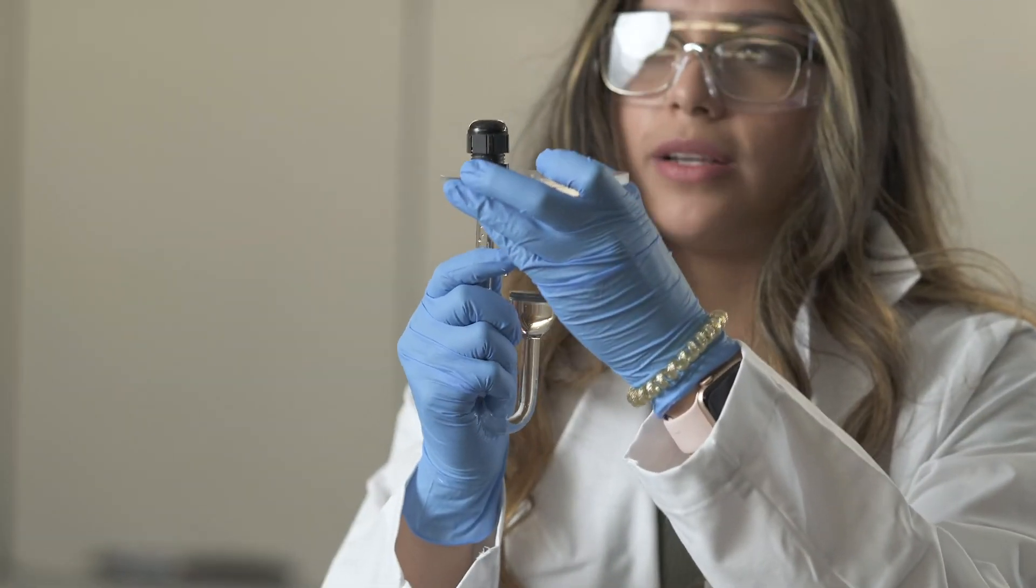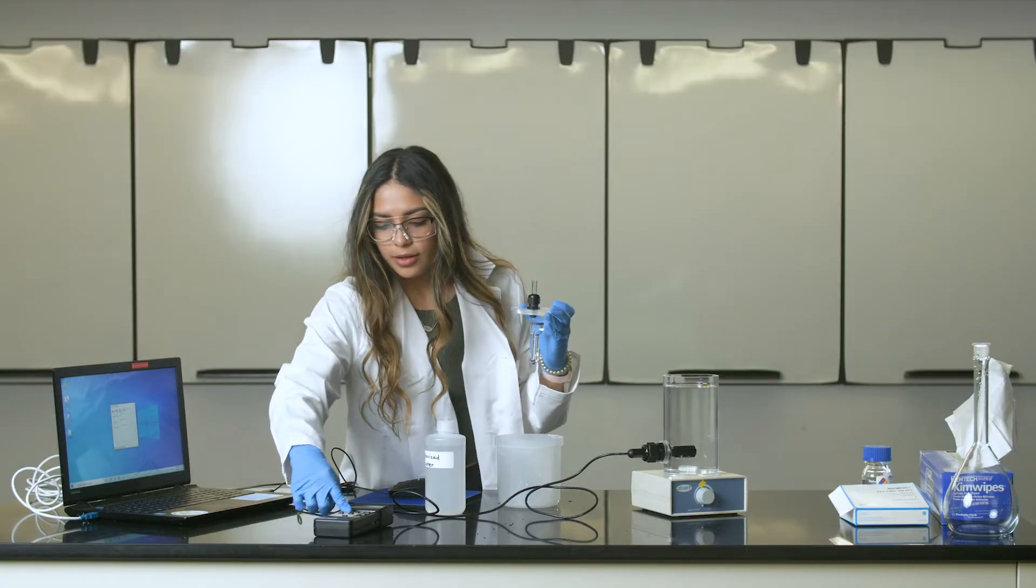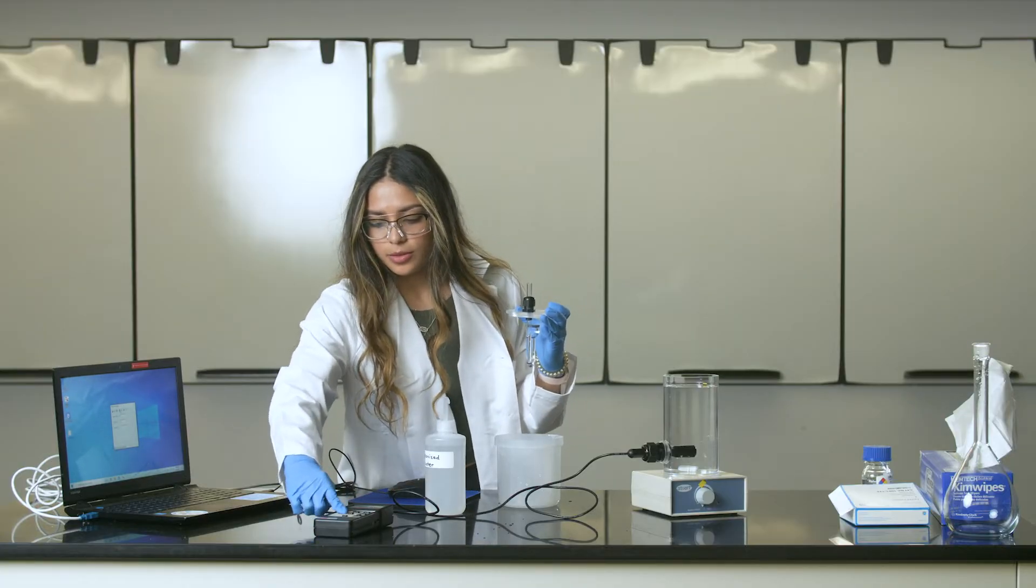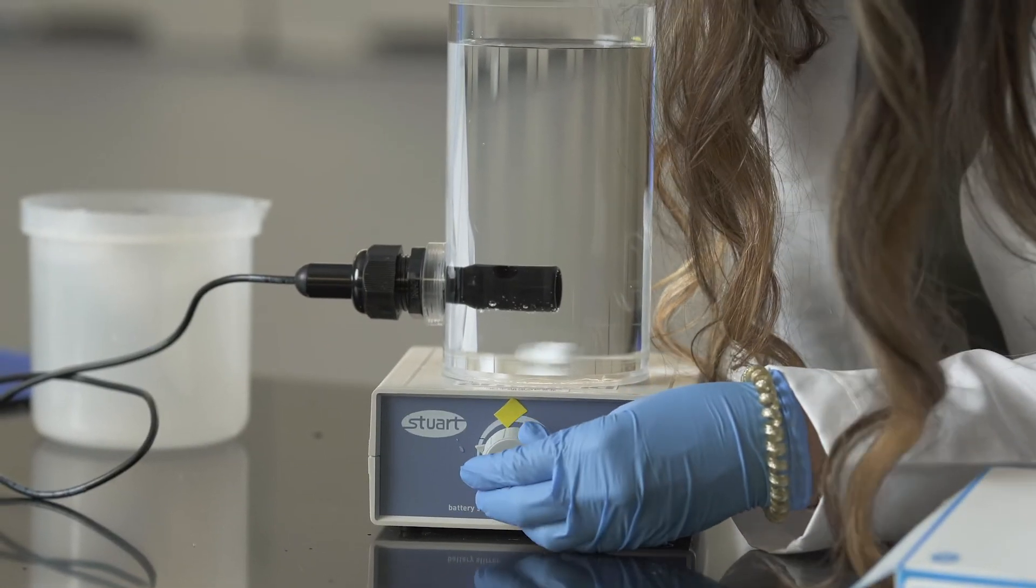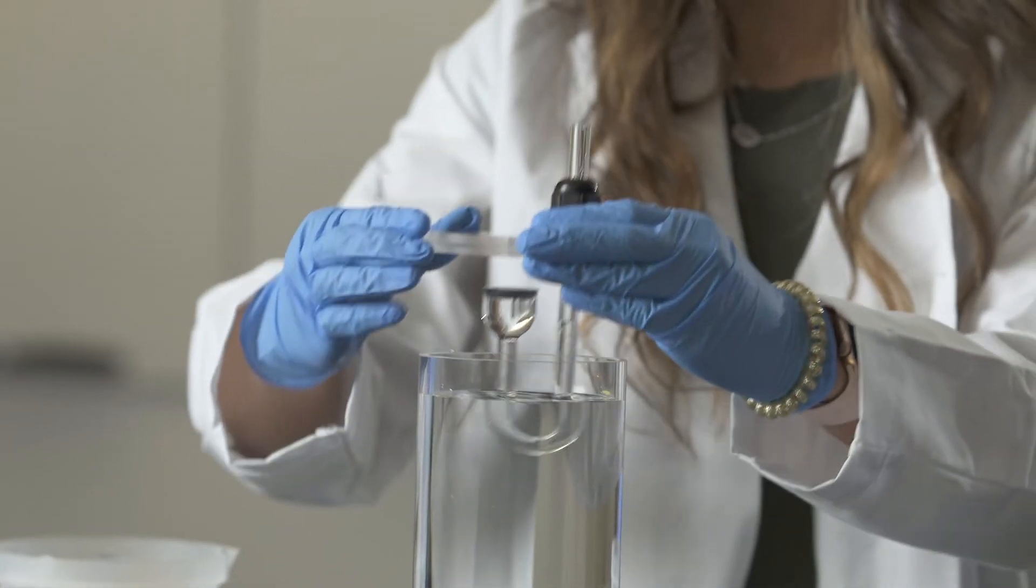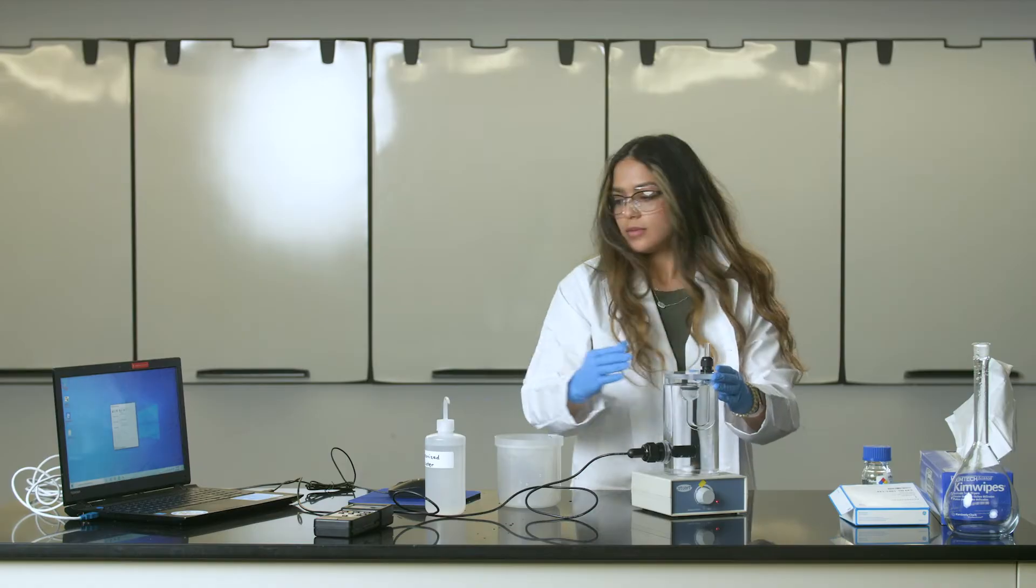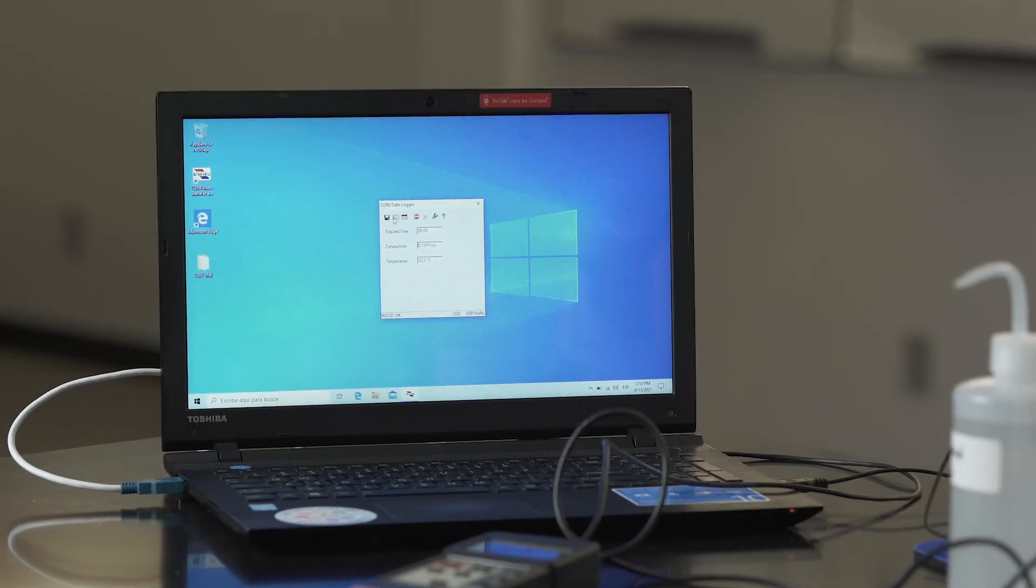Screw the diffusion cell back into the lid. Power on the conductivity meter and press record. Start the agitation and place the diffusion cell into the vessel. Then hit start on the program and open up the graph.